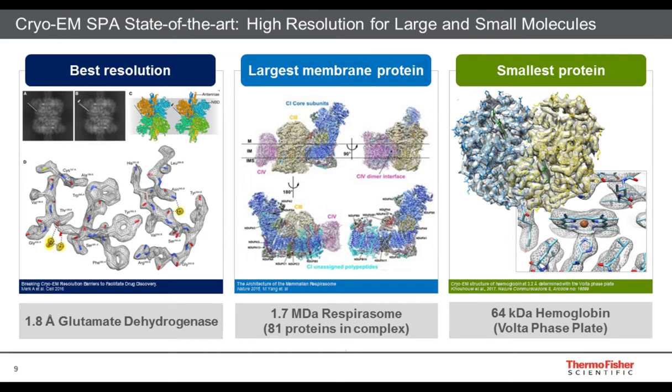If you want to reveal where Cryo-EM currently stands in terms of achievements, to simplify the entire story, the best possible resolution obtained by Cryo-EM single particle analysis is already sub 2 angstroms, 1.8, actually slightly better already, 1.5, heading in that direction. Scientists have gone there with specific samples. You can see individual water molecules, for example, and aromatic rings and side chains at this resolution, which is extremely good.